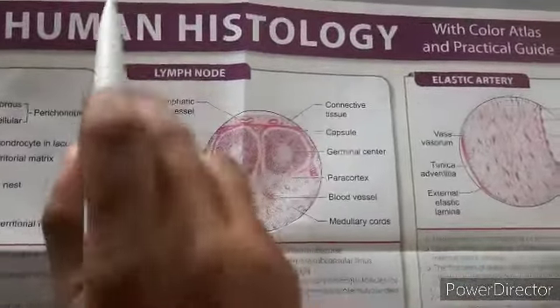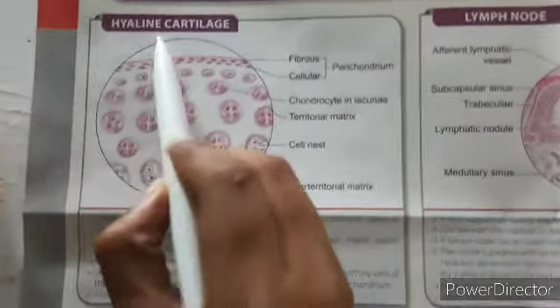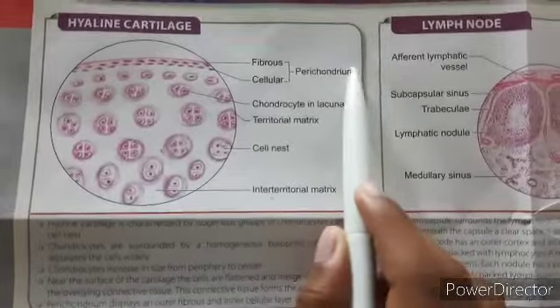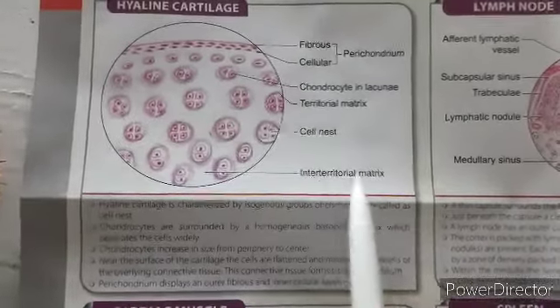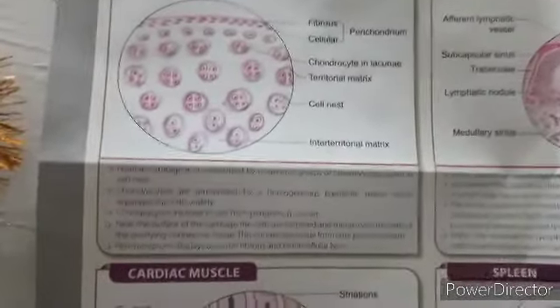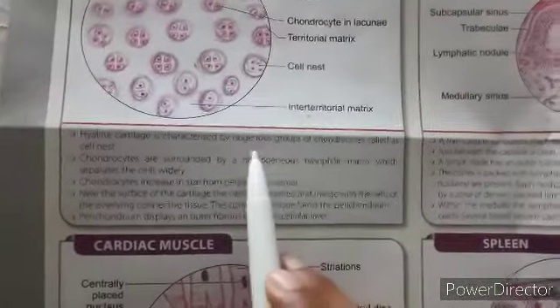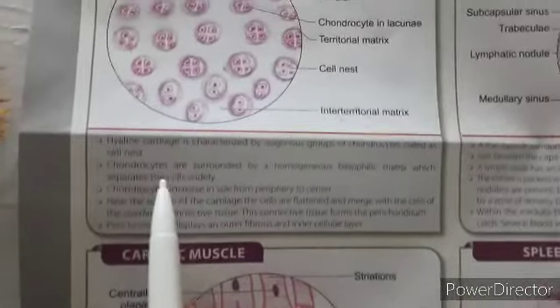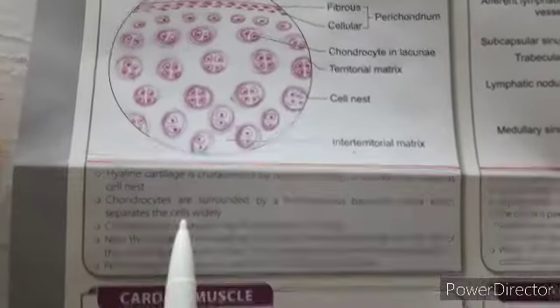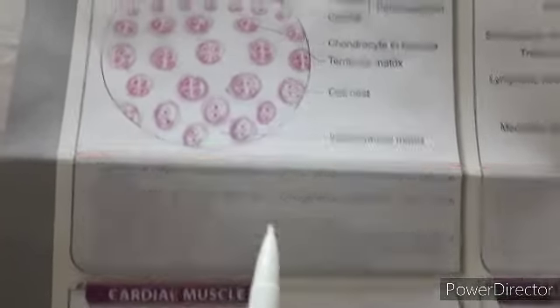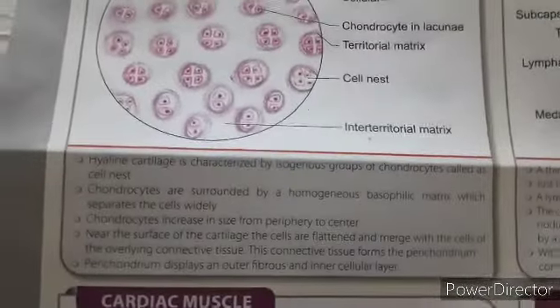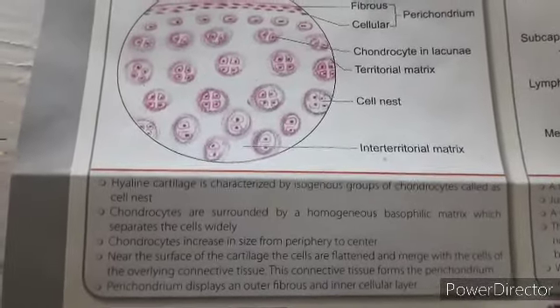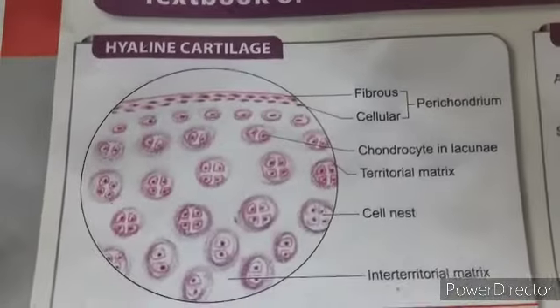Today we are going to do the human histology revision. This is the hyaline cartilage — hyaline means glass. Visible structures include the fibrous layer, cellular layer forming the perichondrium, chondrocytes in lacunae, territorial matrix, cell nest, and interterritorial matrix. Hyaline cartilage is characterized by isogenous groups of chondrocytes called cell nests. Chondrocytes are surrounded by a homogeneous basophilic matrix. The connective tissue forms the perichondrium, which displays an outer fibrous and inner cellular layer.